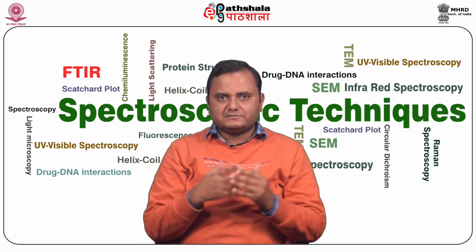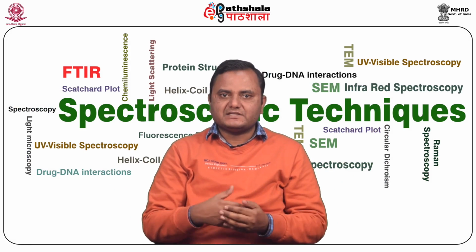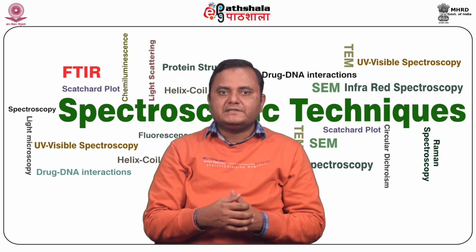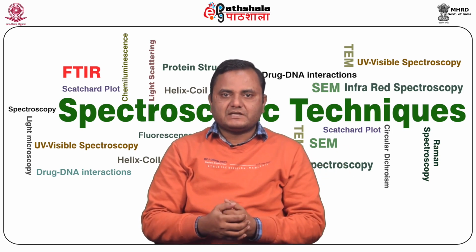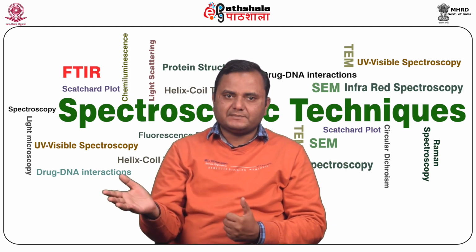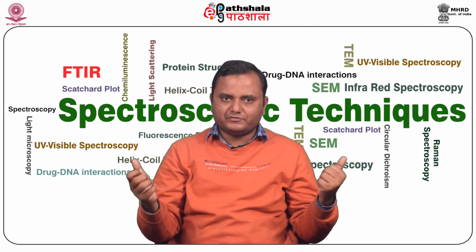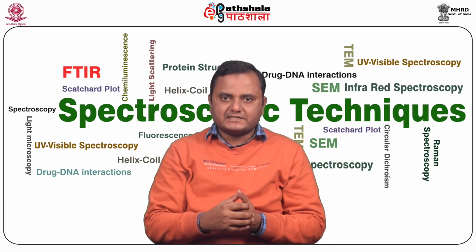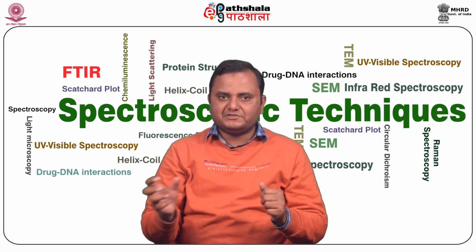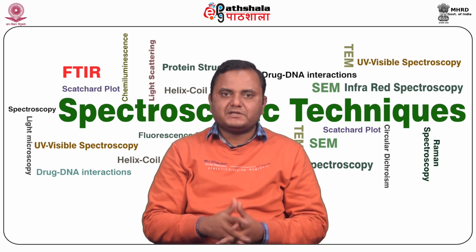Fluorescence resonance energy transfer is a quantum phenomenon occurring between two dye molecules. The excitation is transferred from one donor to another acceptor fluorophore through dipole-dipole interaction without the emission of a photon. When FRET occurs, the intensity of donor fluorescence, lifetime and quantum efficiency decrease, and the fluorescence intensity of the acceptor increases.